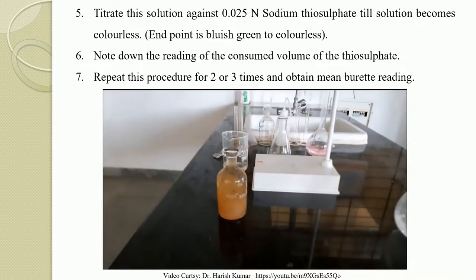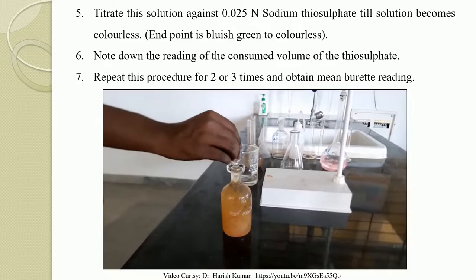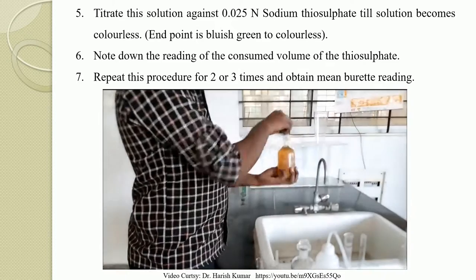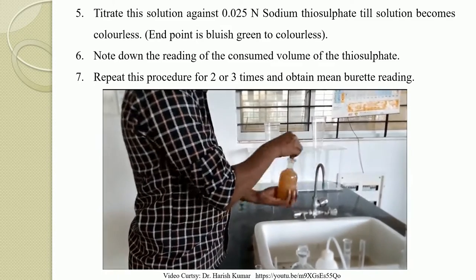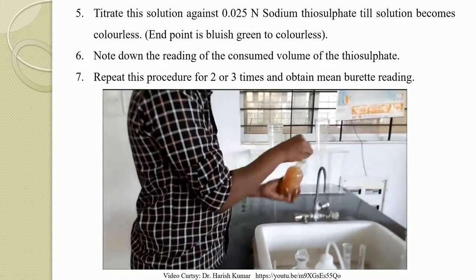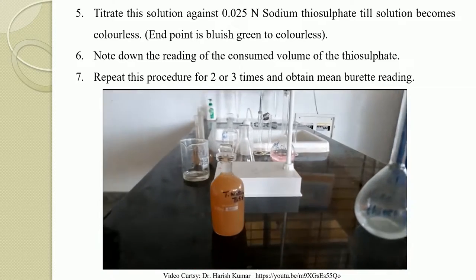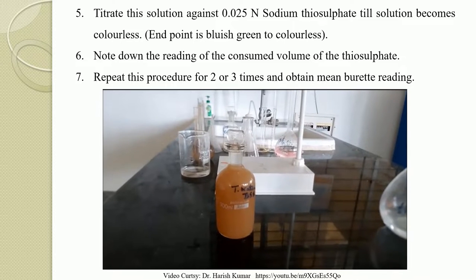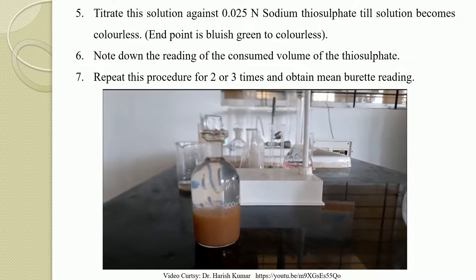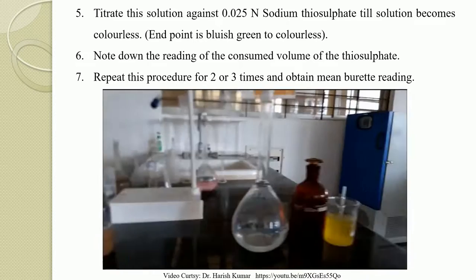Before titrating, mix it well until the air bubbles vanish and then allow it to precipitate. It is being mixed well in order to eliminate the air bubbles trapped inside. Once all the air bubbles are eliminated, allow it to precipitate before the titration. After a while, you can see that it has precipitated completely. Now we'll add concentrated sulfuric acid.